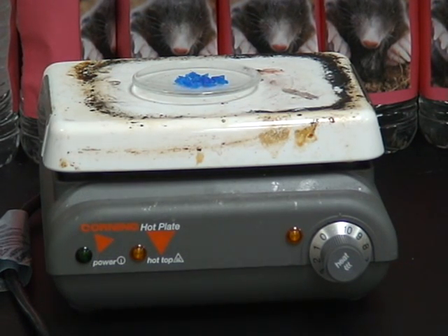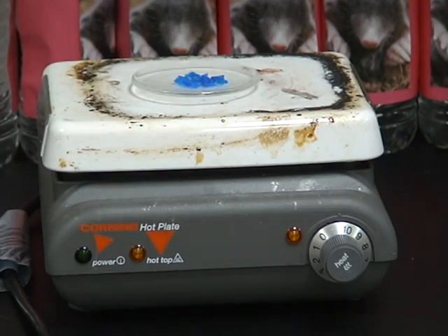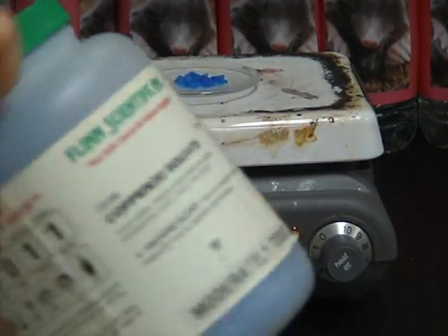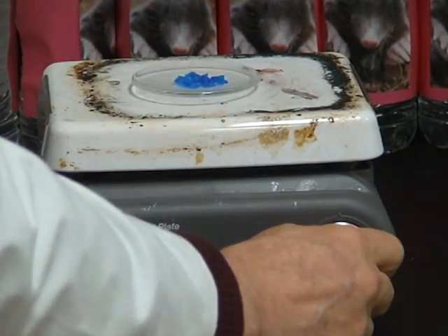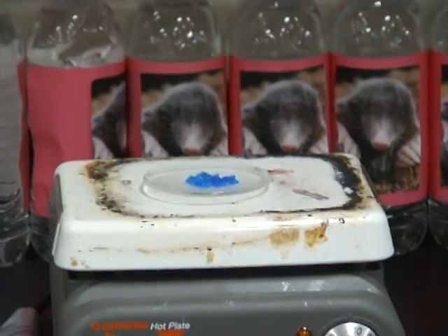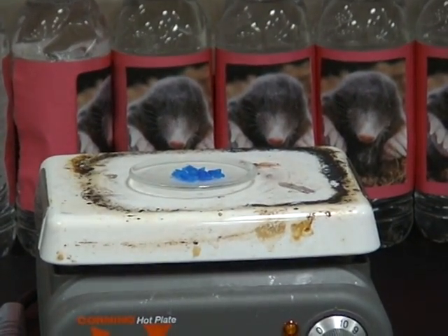Well, what I've got here now is some copper sulfate crystals. And here's the chemical copper sulfate. And I put them on a hot plate. And this is going to take a little bit of time. So we're just going to let them sit on the hot plate for a little while. So you can see that. And while that's happening, I'm going to do some other things.